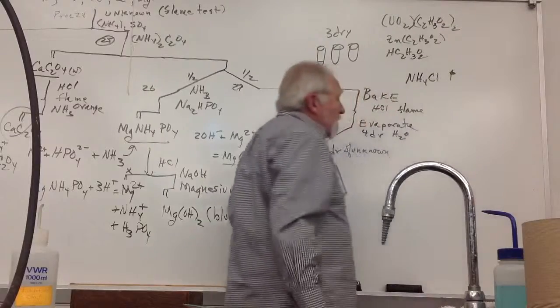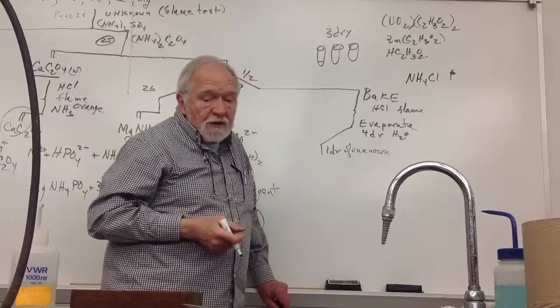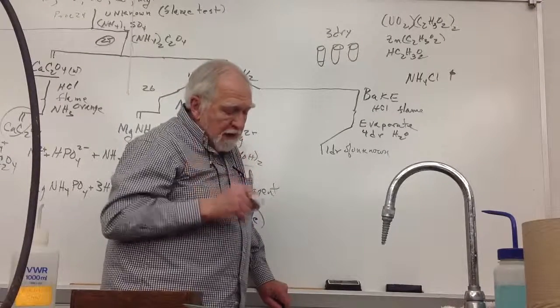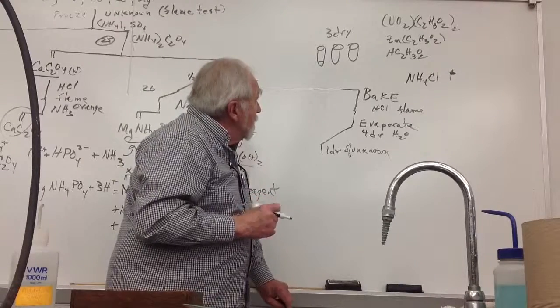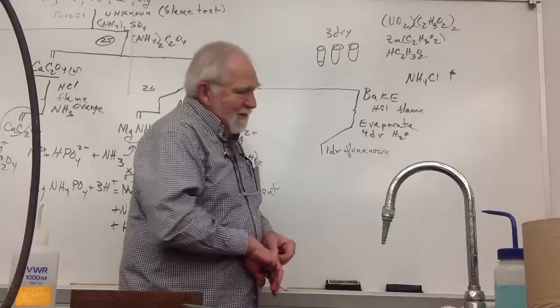That's my zinc uranyl acetate, and it is a saturated solution, so there's always some solid crystals on the bottom of the reagent bottle, so don't suck those up. So you have all of those in there, and it's going to react.